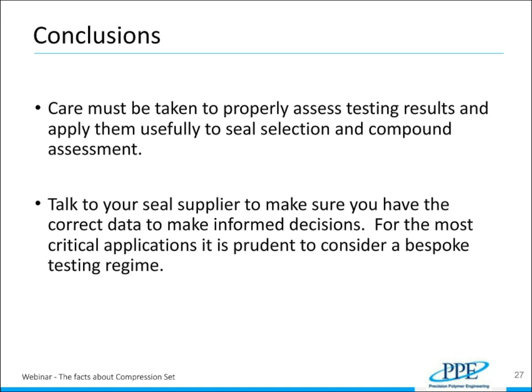And I'd always say for the most critical applications, we'd always suggest that a bespoke testing regime is carried out. That, for example, exactly as the customer did it just a few slides ago, suggested that rather than just air, we carried out some testing in a more applicable fluid.